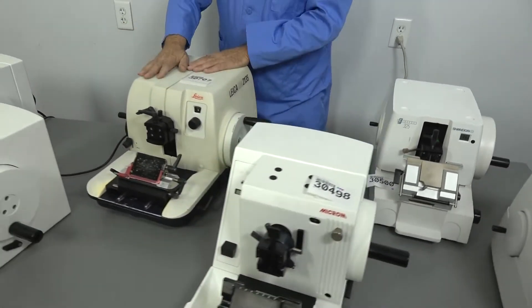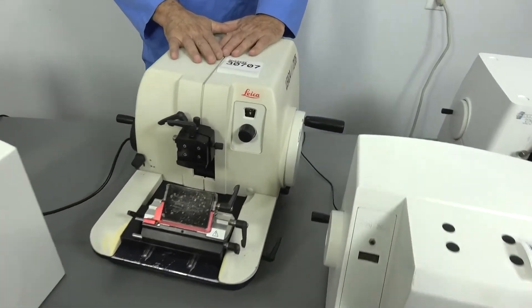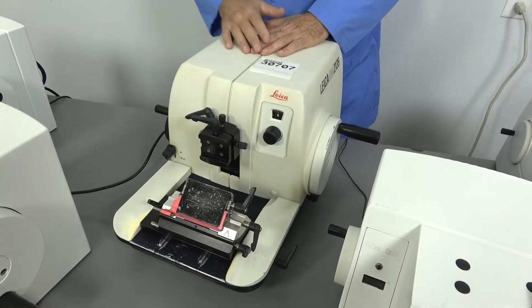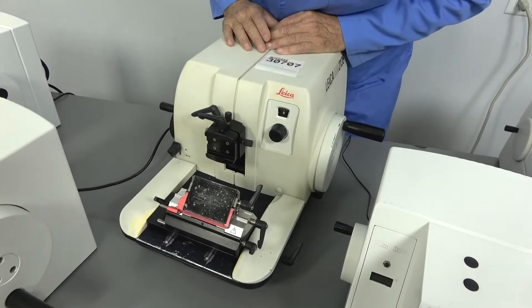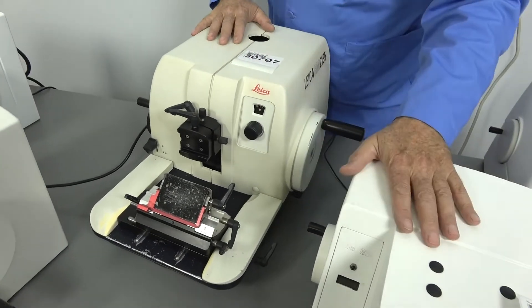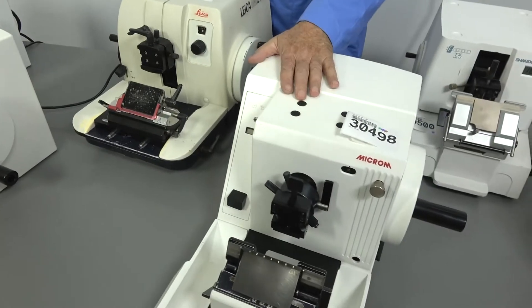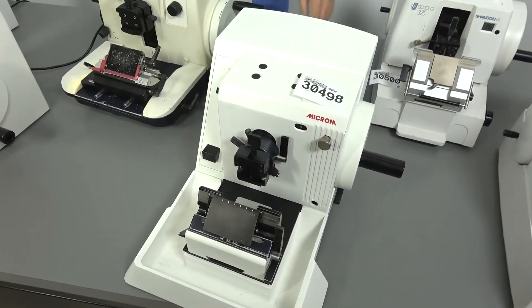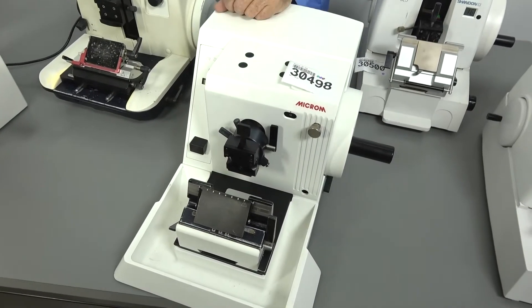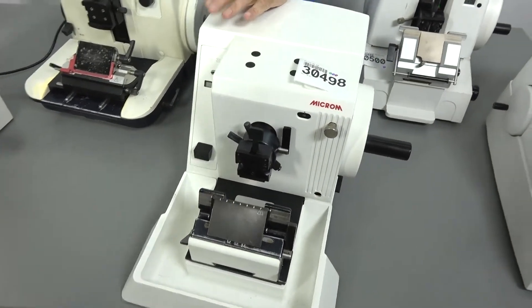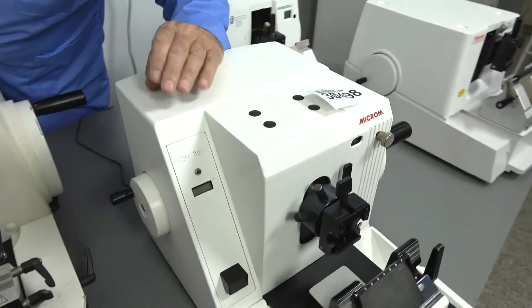The Leica is a mainstay of units. Again, another completely manual unit. There's no battery on this one. Back to the 325, there is a plug-in that runs the counter, but it is not a requirement at all on the unit. It is just there for your convenience.